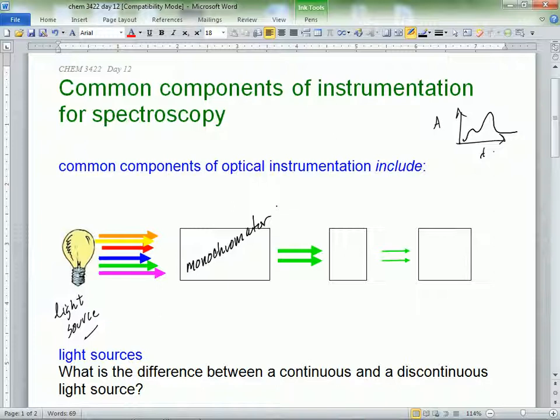But it probably hits what next then? Then it gets attenuated. Well, you've got to put your sample in somewhere, right? Yeah, the little cuvette or the sample holder, your sample. It might not always be a nice little cuvette, because look at the FTIR. If you've done that lab, you even had powders, the diffuse reflectance accessory. The little sample holder can be pretty complicated, but it's there. Every instrument has it, right?